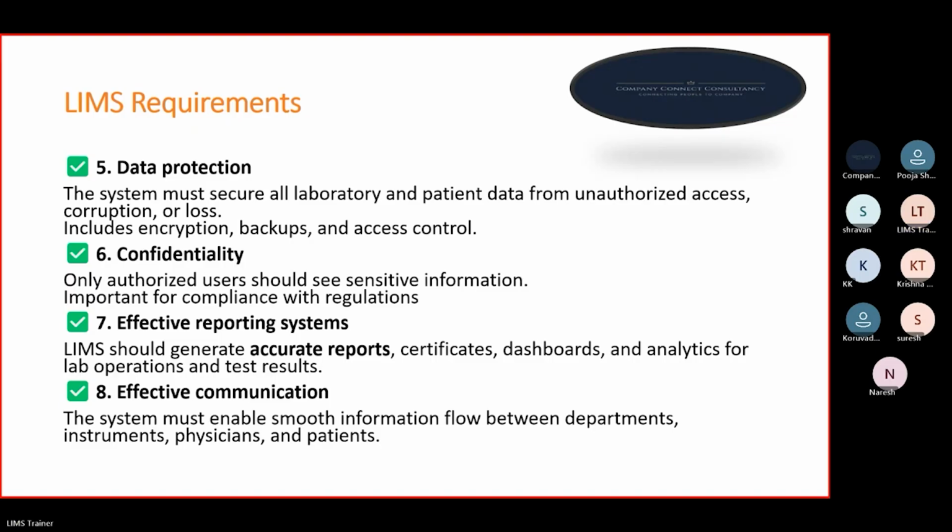Effective communication. The system must enable smooth information flow between departments, instruments, physicians, and patients. So what is effective communication here? Let's say there is a flow in the quality control laboratory. Your team lead can receive the sample and allocate it to different analysts.